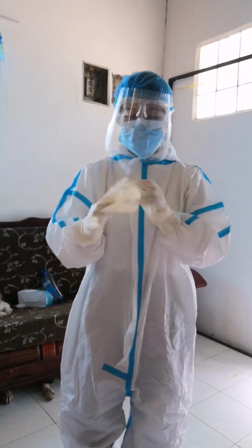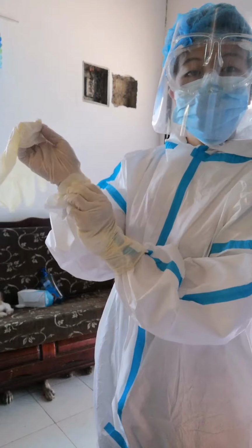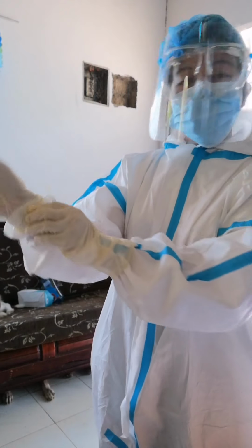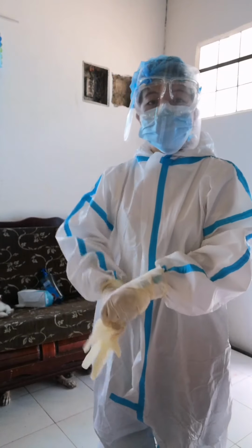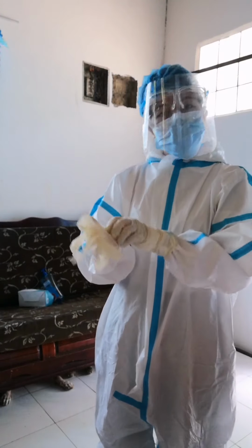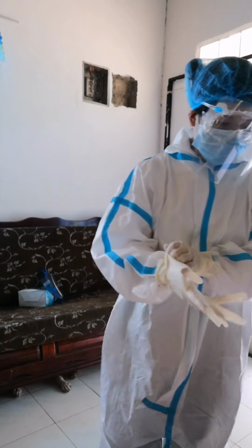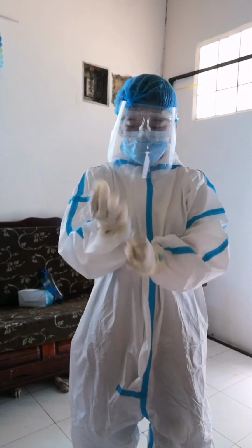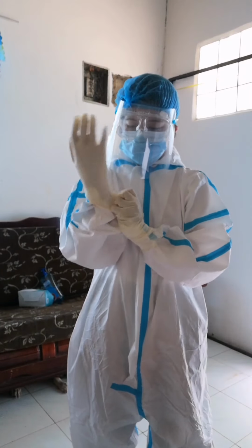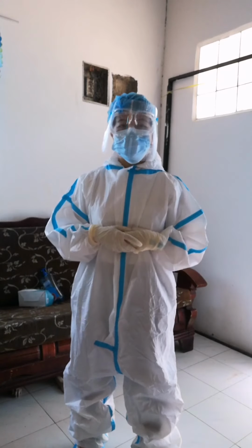So it is advisable to enclose the ends of the gown with the gloves so that even a slight exposure of our skin will be prevented. So that is it for donning our PPE.